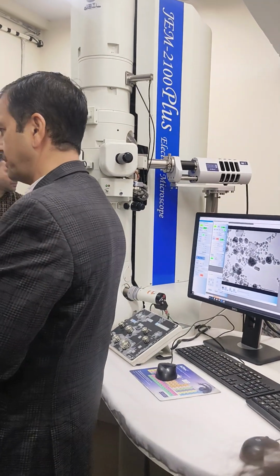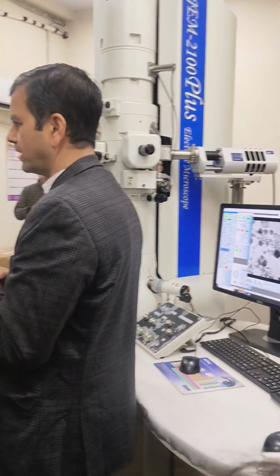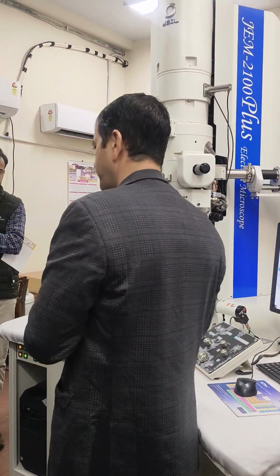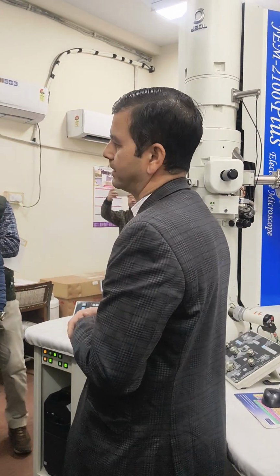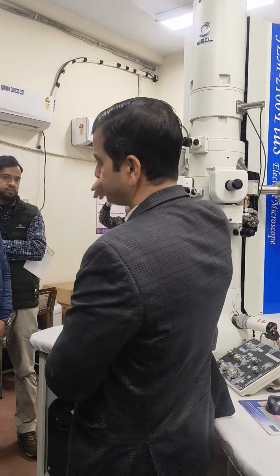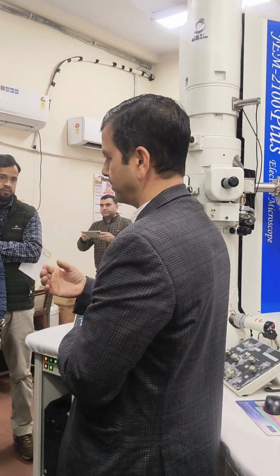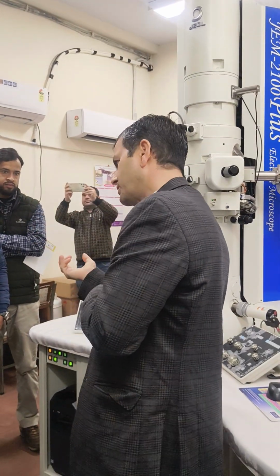That is needed for biological samples. That is the normal type. We also have one that is not working right now, but that was up to 120. Then the advanced next version comes to 200 kV. kV means kilovolt, the accelerating voltage, generated from the top. Higher accelerating voltage means smaller wavelength and finer resolution.